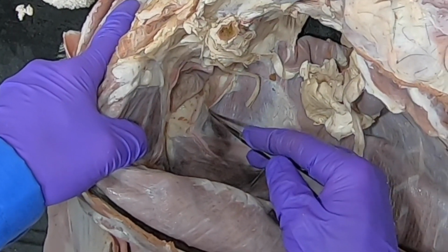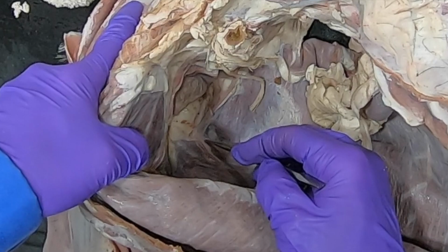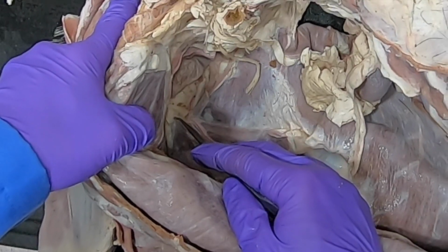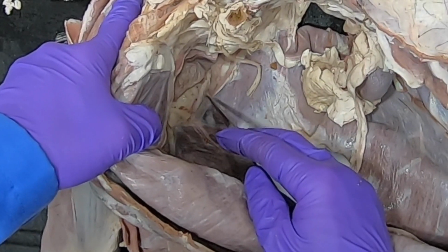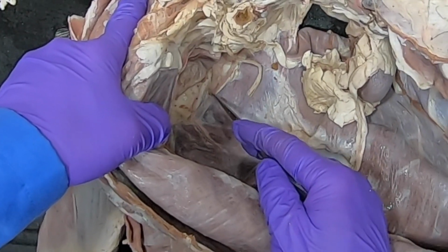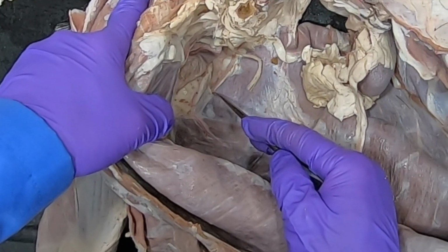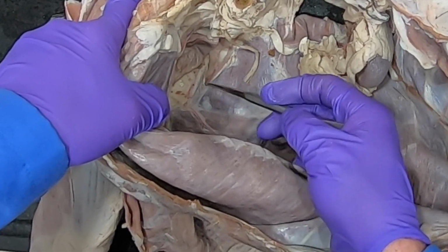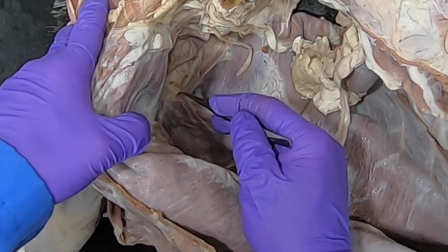Okay, so the deep inguinal ring, its boundaries are the caudal border of the internal abdominal oblique, the rectus abdominis or the prepubic tendon, and then the caudal border is going to be that inguinal ligament that we can't see here. It hasn't been dissected out. Okay, so this is our vaginal ring, which is basically the peritoneum, where it changes from parietal peritoneum into parietal vaginal tunic as it descends down with the testes.